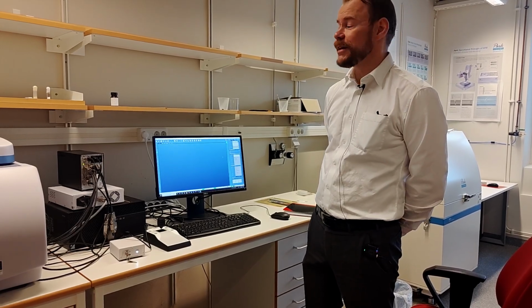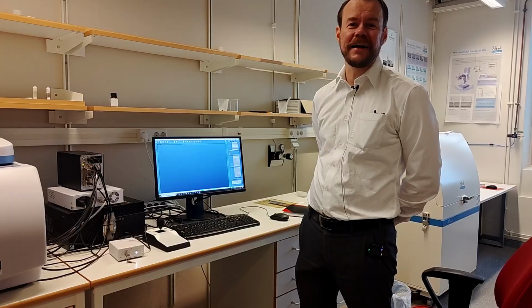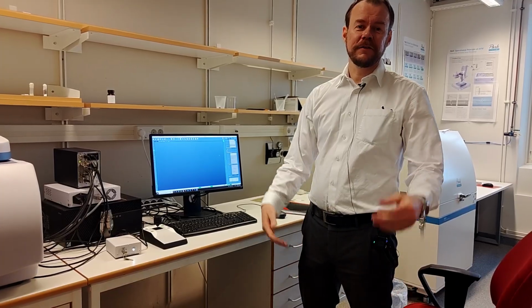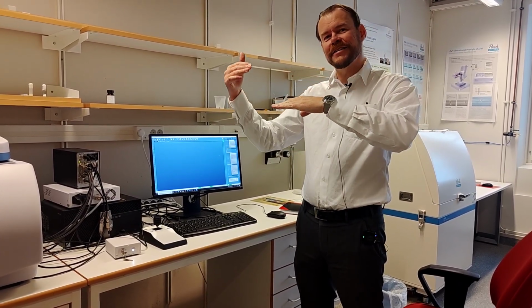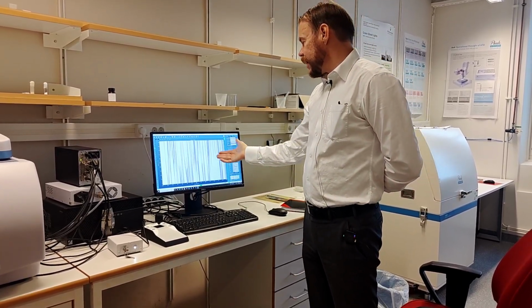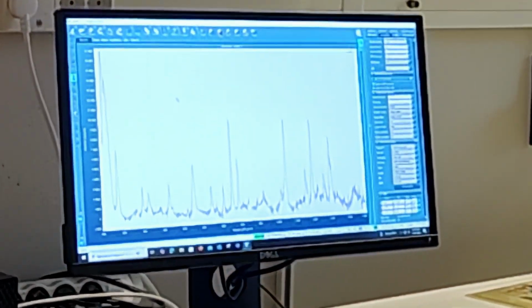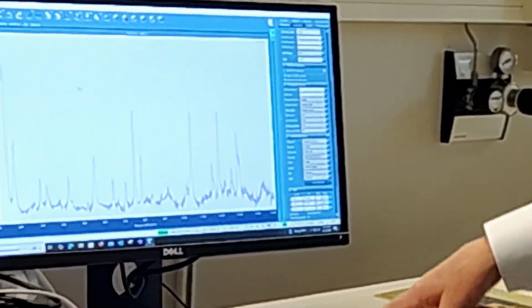And if that happens, you will see in the camera a hole after a while, or it becomes black or stained or something like that. But you can also see it in the spectra, because the spectra is changing over time. The material you're looking at is decreasing in intensity, and then something else starts to appear because you're creating soot or something like that. All right, now it's scanned for 1 minute. Let's rescale everything. Here we see the spectra from 100 to 1500, because we wanted to scan from that range.